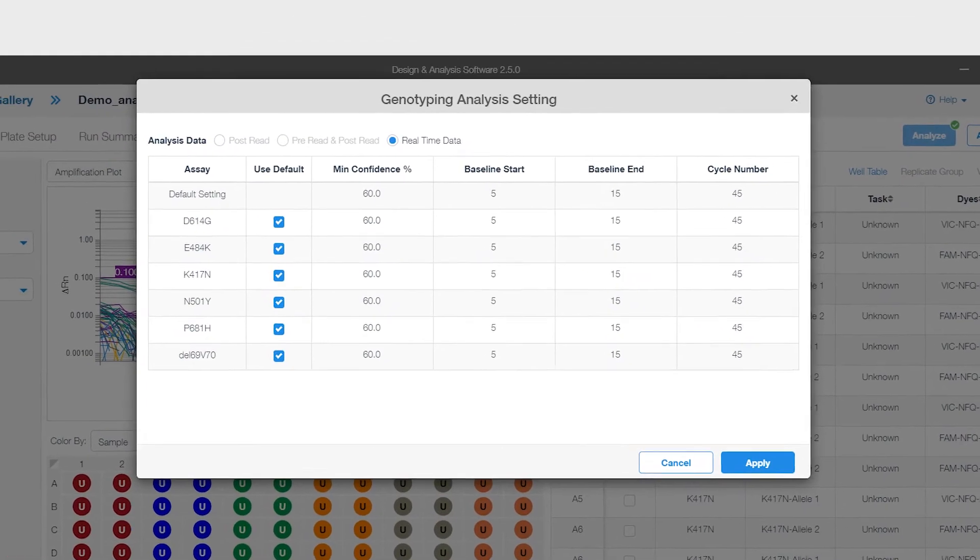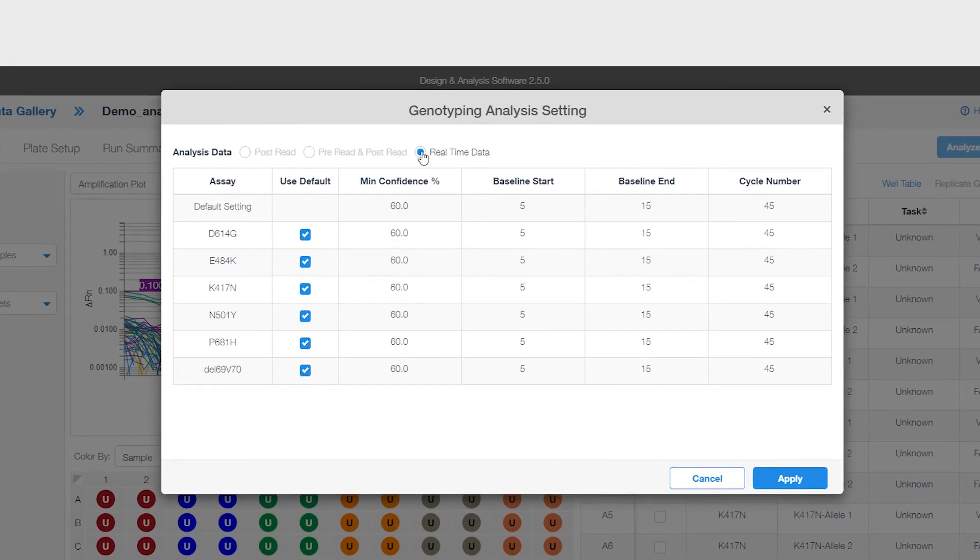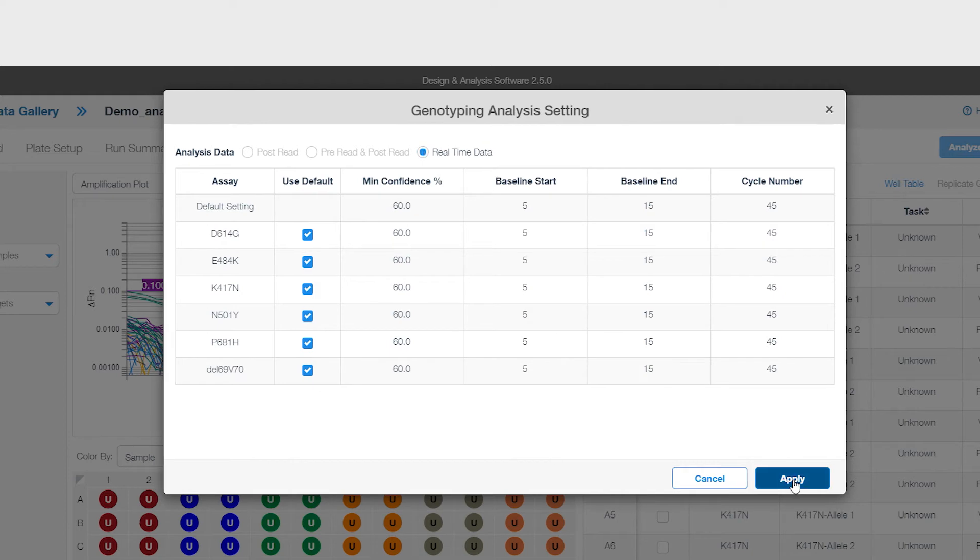In the Settings box, check the box next to Real-Time Data along the top and click Apply. It will automatically analyze when you click Apply.